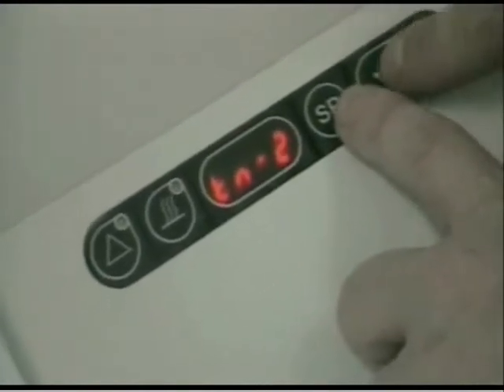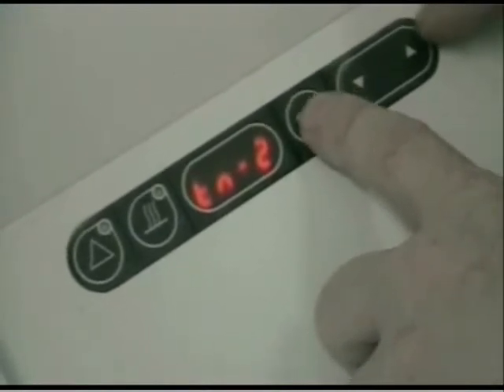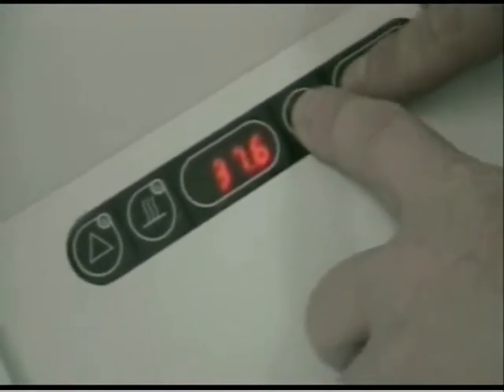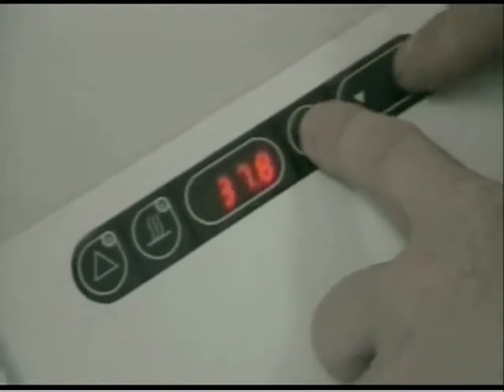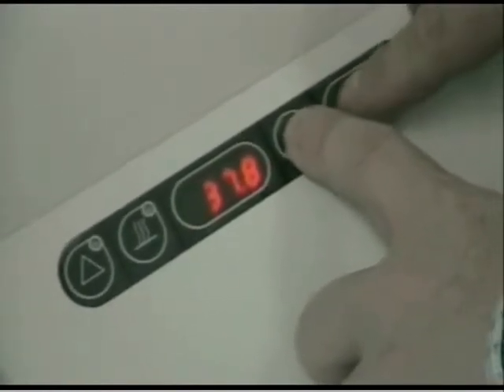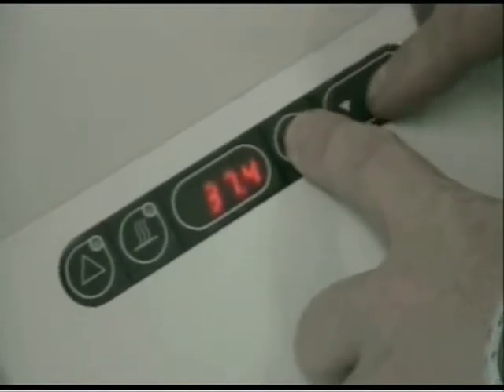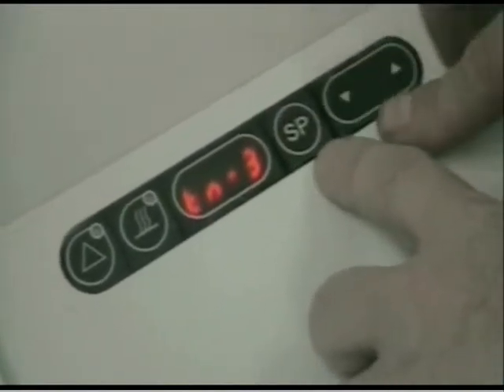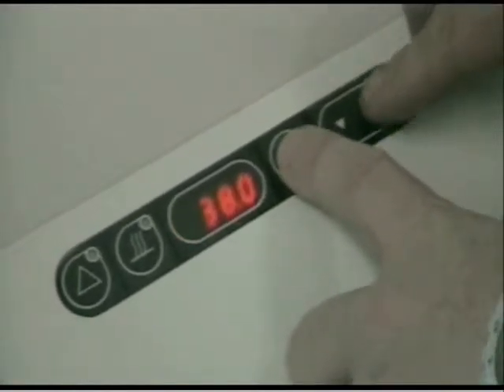Then we scroll down to tune 2, and we have a measurement there of 37.41, so we need to adjust it down. Tune 3 has a measurement of 37.45. Then tune 4 we adjust to 37.48, so 37.5.